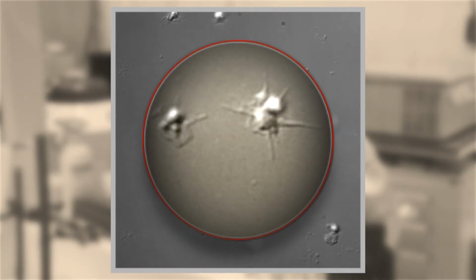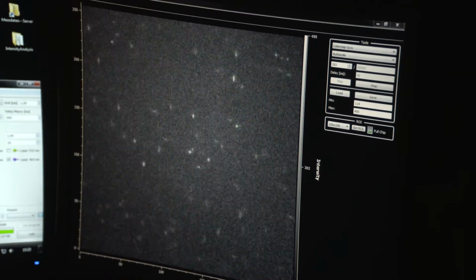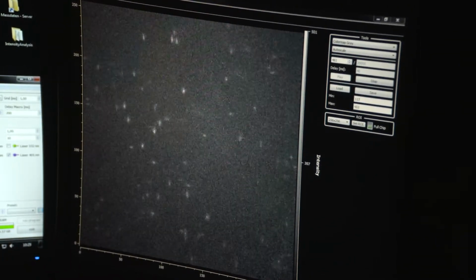Super-resolution microscopy is a modern technique used at Time Center. It is state-of-the-art in only a few medical studies around the world, but it will fast become the gold standard in light microscopy. The super-resolution microscopy allows us to image cells and tissues in 3 dimensions below the resolution limit.